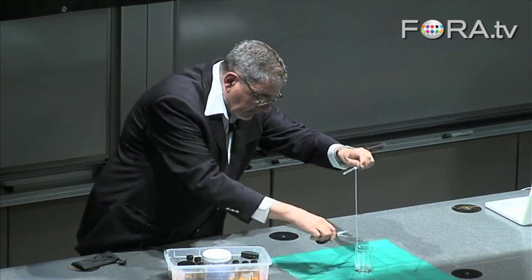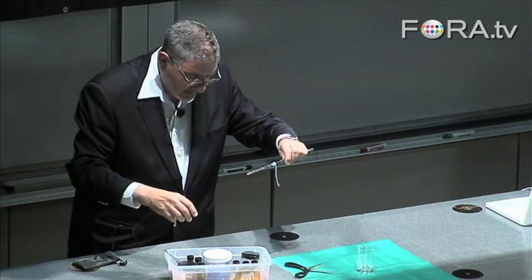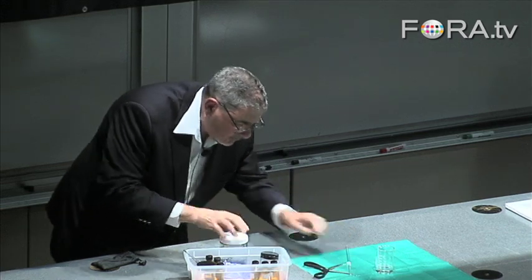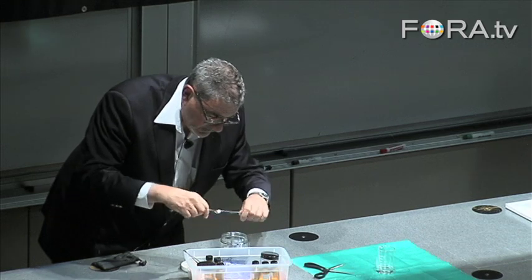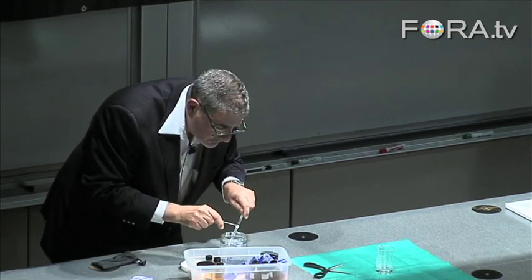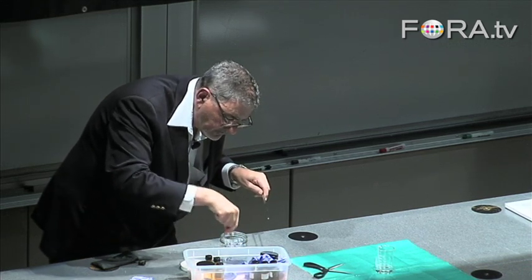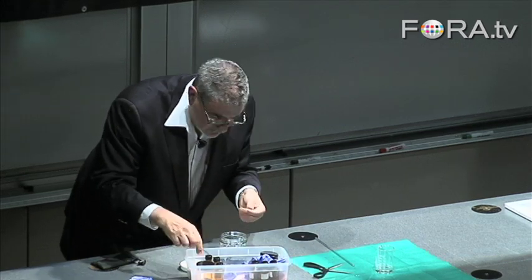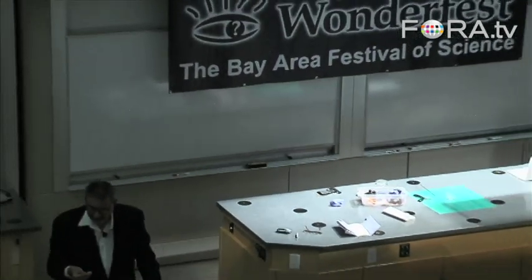And so we're going to cut it. Now what I want to do is I want to wash it for you. I'll put this down for a moment. Just wash off excess material. And I'll just use the tweezers. And this stuff, of course, sticks to itself. I'll wash it around. Folks, we have nylon.